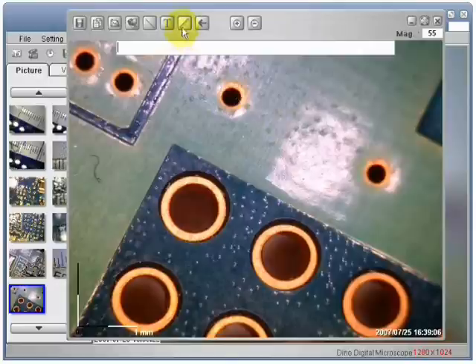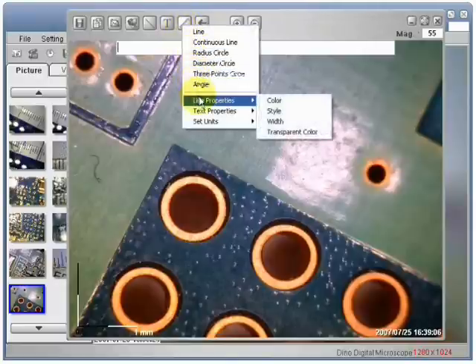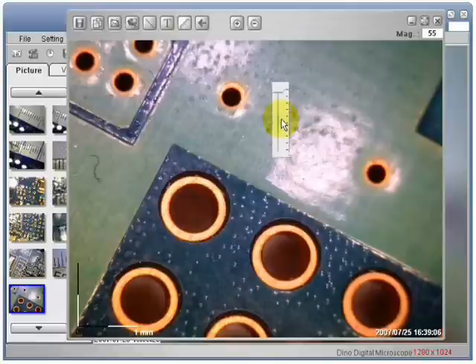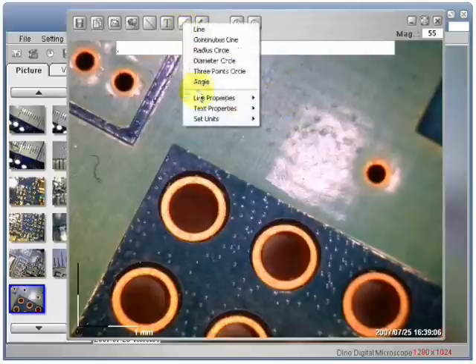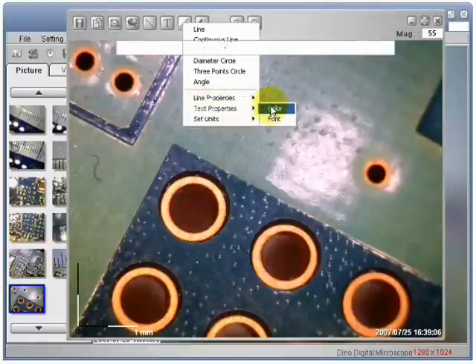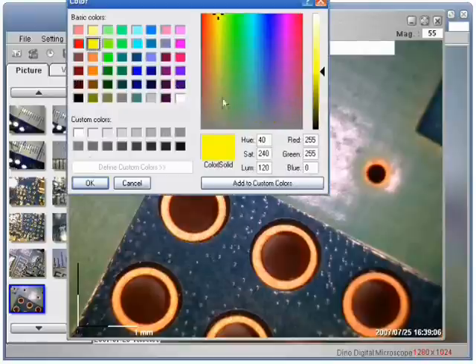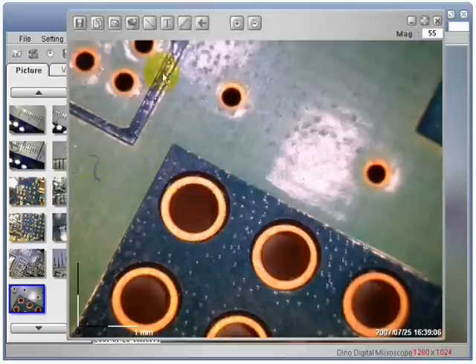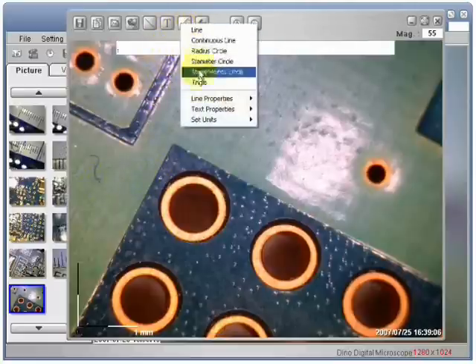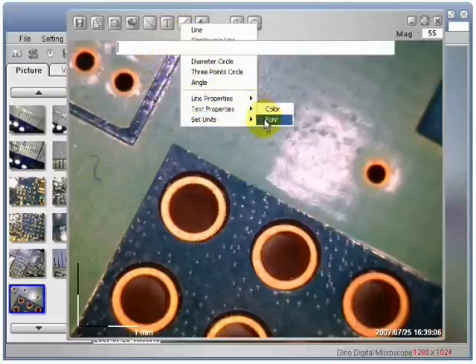You can customize your text and line properties with DinoCapture. I am going to change the width of the line to size 3. Now I am going to change the font color to green. Now I am going to change the text size to 12 and the font of the text to Bookman Old Style.